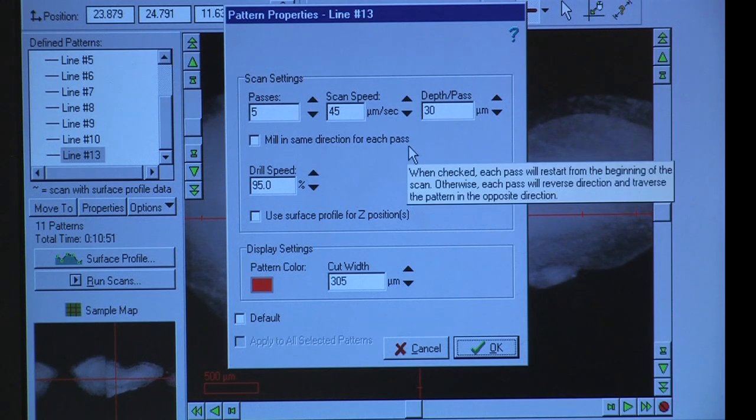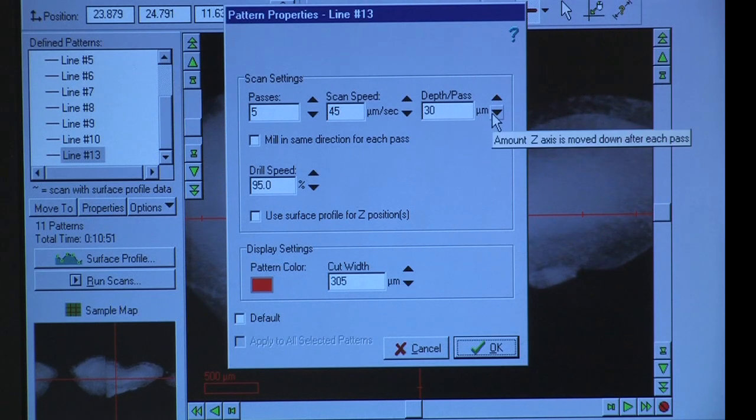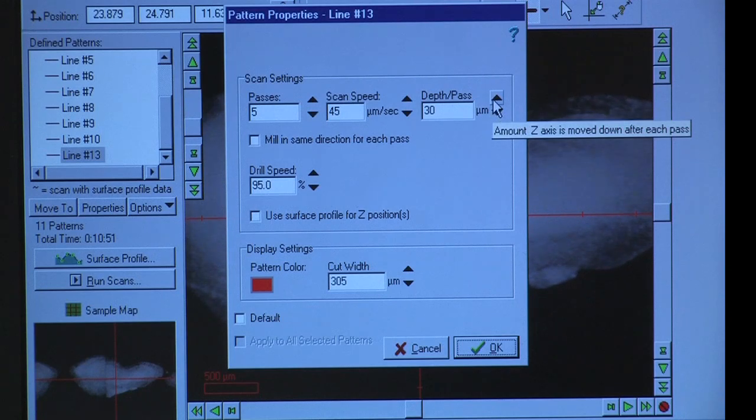Depth, the depth the drill cuts with each pass. This is usually set between 30 and 50 microns.